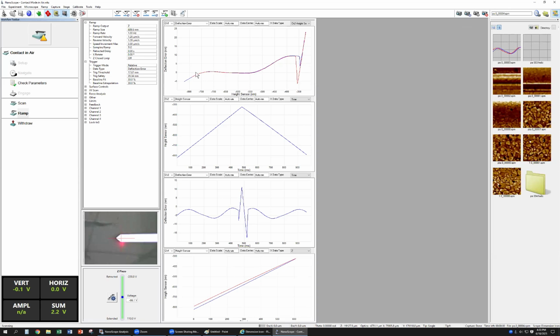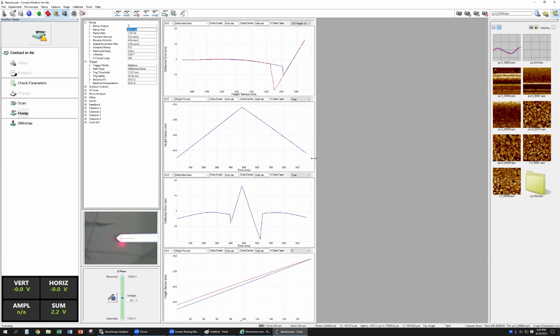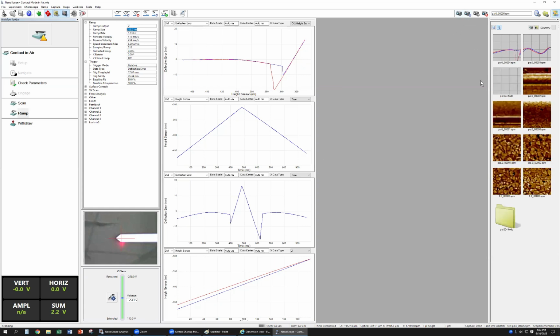You can see there is a lot of variation. That variation comes from the laser, which means there is laser interference. If you want to reduce this, the laser should be adjusted a little bit inside. Yeah, and you can also reduce this one. For example, I can reduce it, so that it's a little bit flat, then there will be less interference.